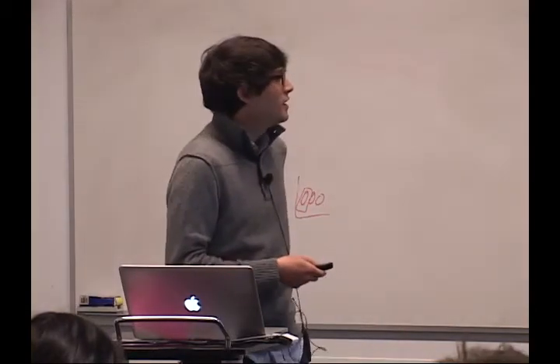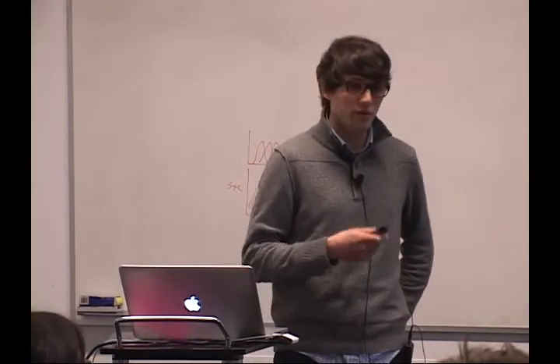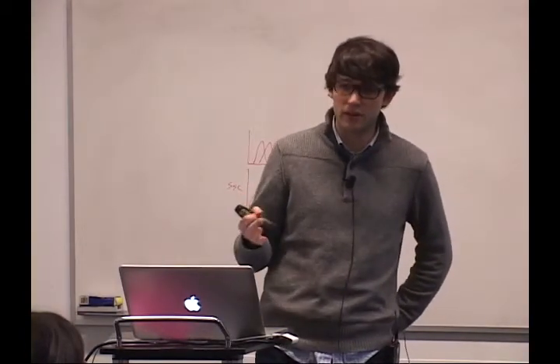And I know it's kind of late in this seminar series for you guys to see this set of slides. I think in future years we should do this earlier, because I think SPADE has become so integral to the way we look at our data now that you've probably seen a dozen or 2 dozen SPADE trees by now without really getting a full explanation of what those things are. So I'm going to try and walk you through SPADE and how it works, and then a little bit of the, because this is a training course, the practical side of setting up your own SPADE analysis.